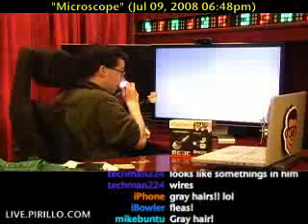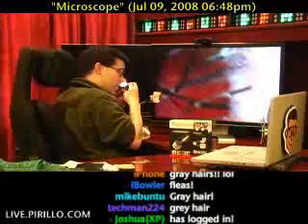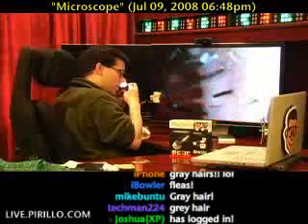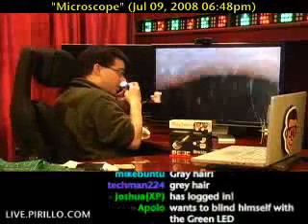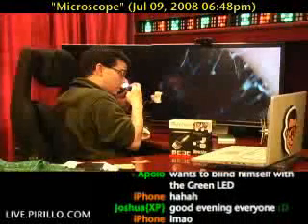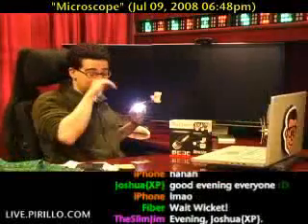Let's try looking up my nose. Oh yeah, that's the best one yet. I know what you're thinking — oh no, he didn't. Oh, I did. Look at that. Yeah, seriously, that's my nose. That's live, man. That's in real time.